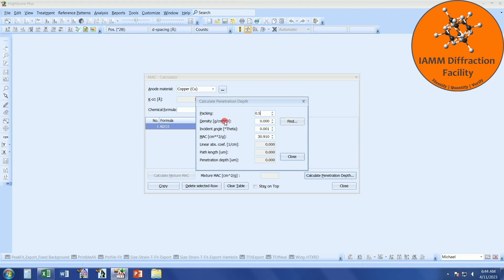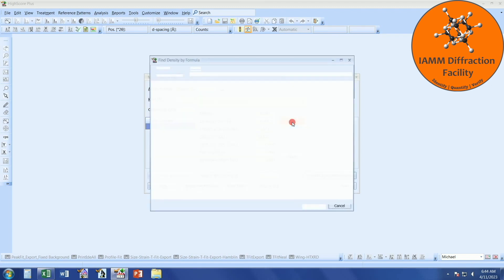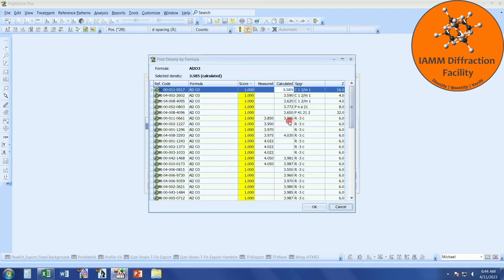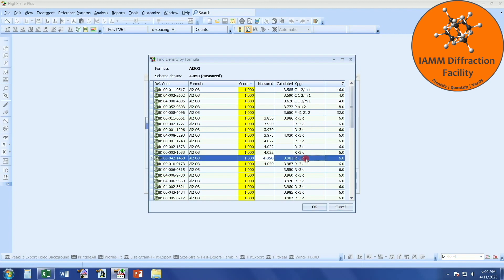Here is the density in grams per centimeter cubed. If you know it, you can type it in here. If you aren't sure, you can click Find. We see that the software found all of the aluminum oxide entries in our database. I know it has this space group, so I will click this one. They're all pretty similar, so it won't make a big difference which I pick. Once you have one selected, click OK. We see it show up there.